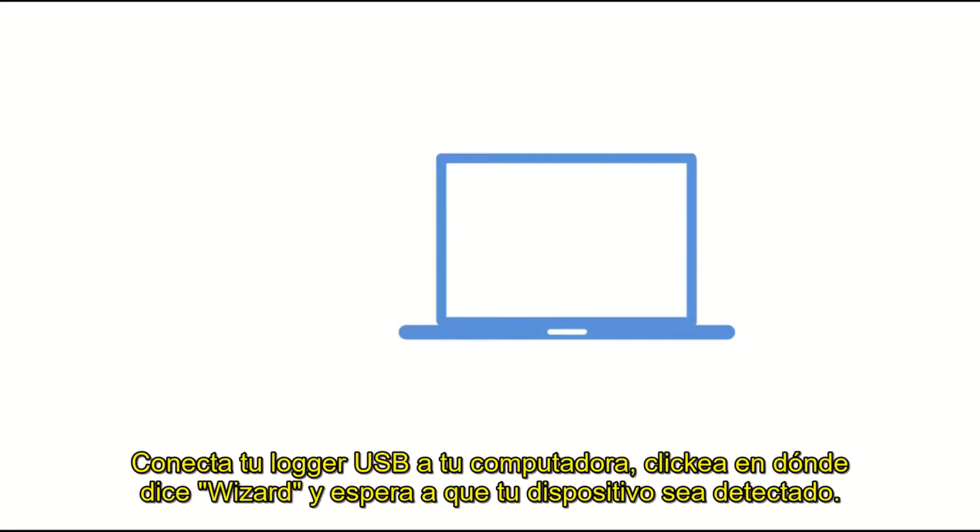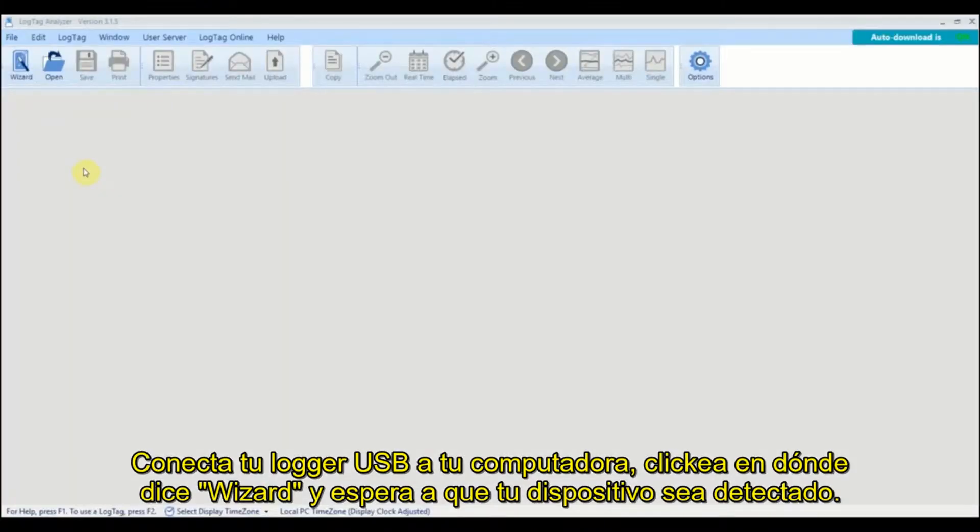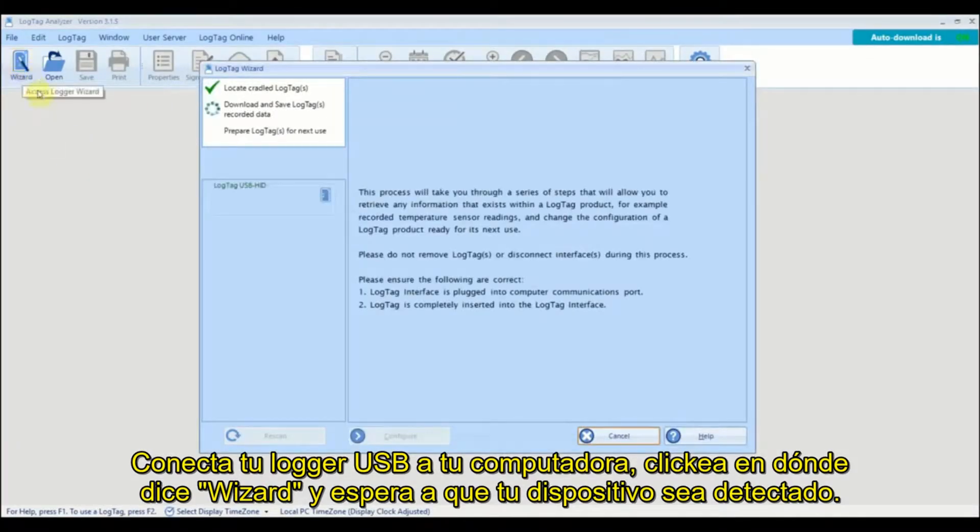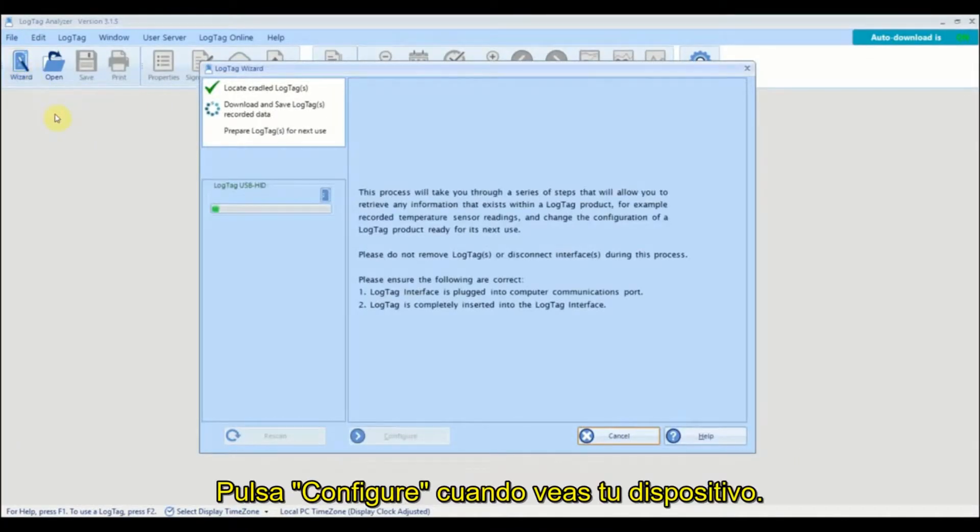Connect your USB logger to your computer. Click on the wizard icon and wait for your device to be detected. Click configure once you see your device.